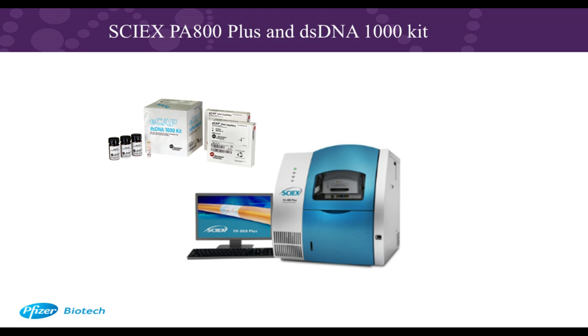So for this method, we use the SCIEX PA800 Plus instrument and the double-stranded DNA 1000 kit by SCIEX. This kit includes 2 coated DNA capillaries and 3 vials of lyophilized double-stranded DNA 1000 gel.